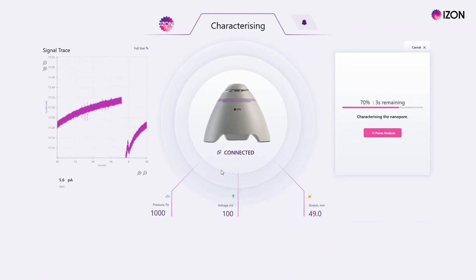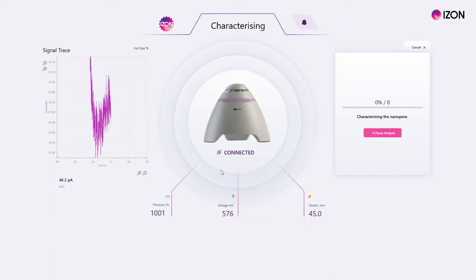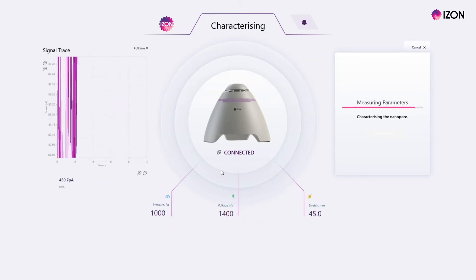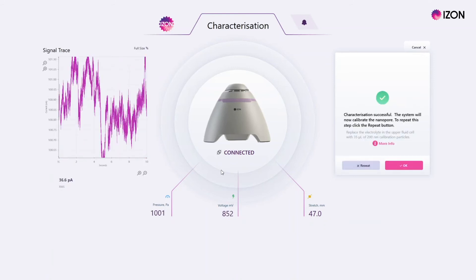Wait for the initial characterization process to complete. This involves the system measuring the baseline at multiple stretches at 1000 pascals, then adjusting the voltage to result in a current of approximately 100 nanoamps.